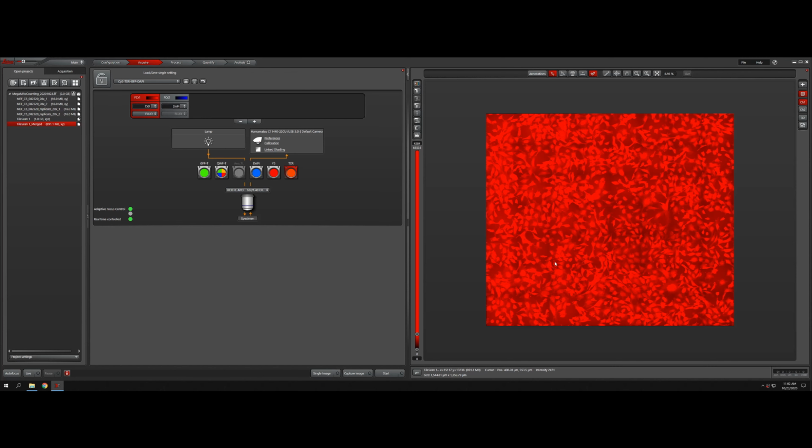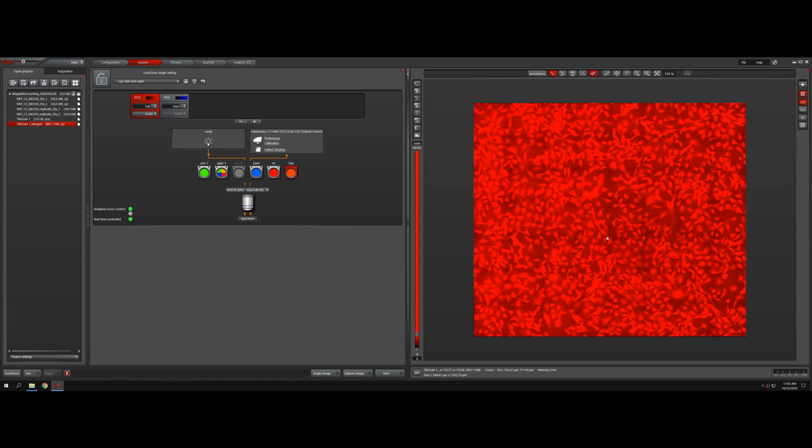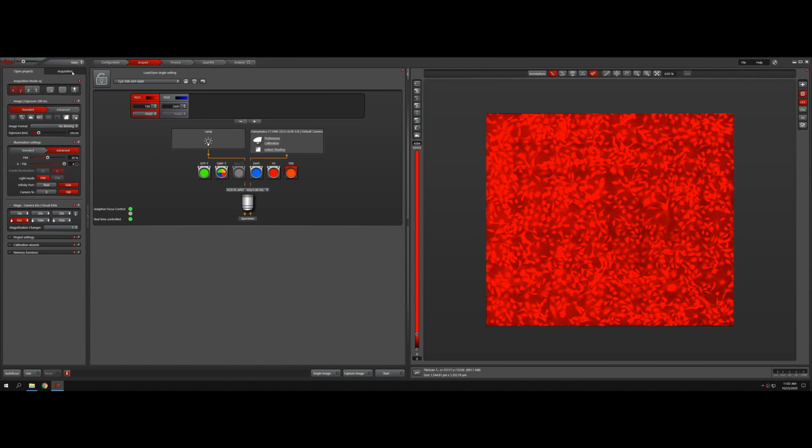If I go down on the scale range to display the image, it's not too bad, but you can see these regions, like the ends of individual frames. You can see they're a little bit dark, so you can flatten this out by using something that's called shading.